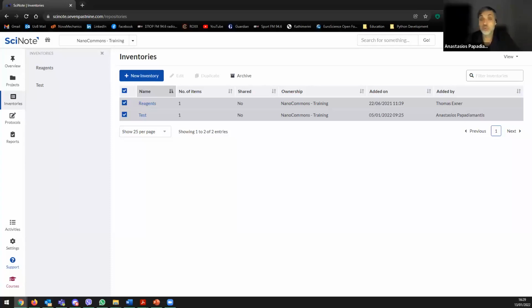So in practice, this is why you can choose specific people to be able to see specific projects and specific experimental processes within a project. So even within a project, you can have people not being able to see the data.